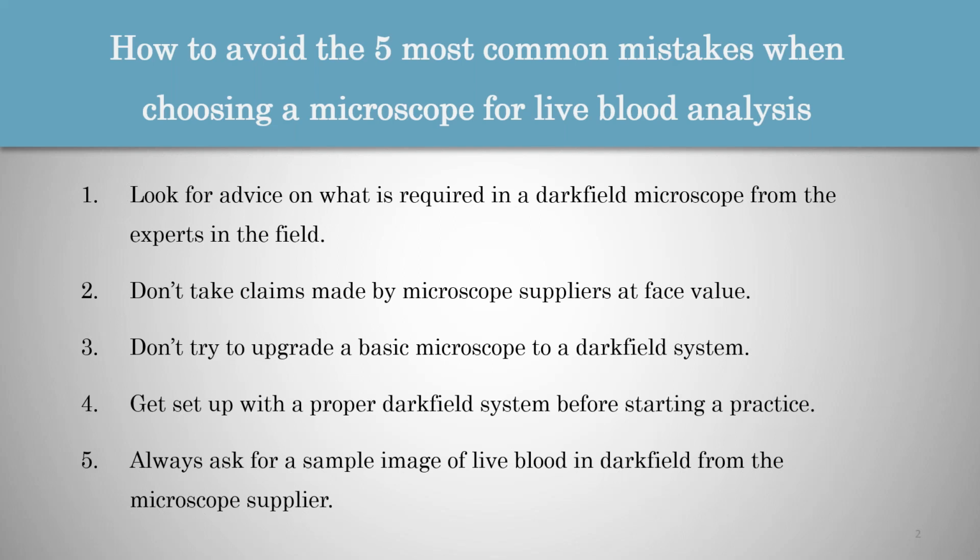Many of the microscopes available online, on well-known websites that sell microscopes online, would all be from China. And while some of the microscopes from China are quite good quality, and many of the components and microscopes that are actually sold under famous brands are also manufactured in China, when they're not really branded microscopes, there's always a lot of variation in terms of the quality. So you'd often end up getting a microscope that really has a very, very poor build quality and is not really reliable.